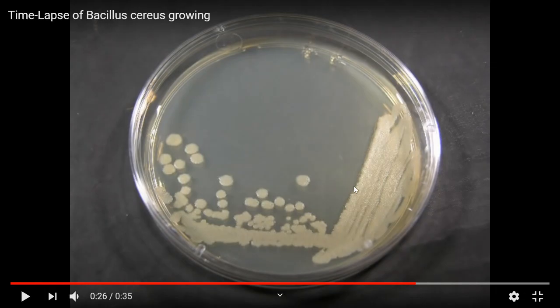If you took it from the edge of zone 1, well, that's where the healthier bacteria are, because they're growing and spreading outward. And a colony, again, these are young, healthy bacteria. So you would not find spores here unless you let the plate sit for a week. But after 2 or 3 days, in the middle of zone 1, you'll start to see spores developing. So that's where you would have looked for spores on your second unknown, in the middle of zone 1.